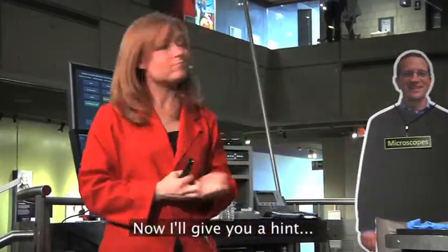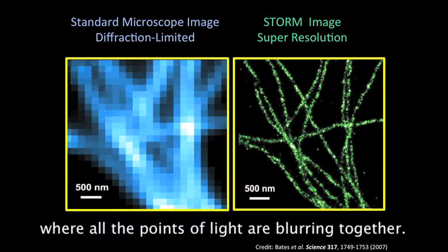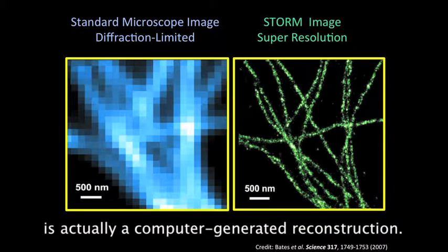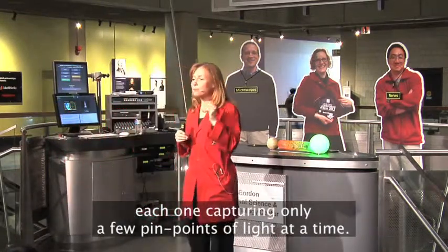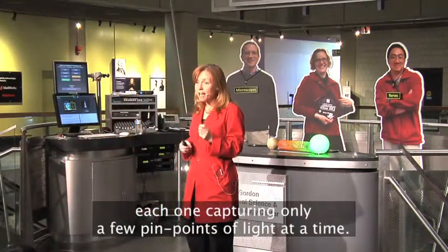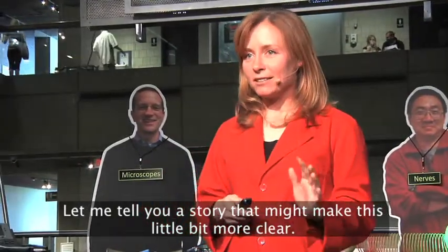Now I'll give you a hint. The image on the left is one single image, where all the points of light are basically blurring together. The image on the right, though, is actually a computer-generated reconstruction, essentially a stacking of thousands of images, each one capturing only a few pinpoints of light at a time. Let me tell you a story that might make this a little bit more clear.